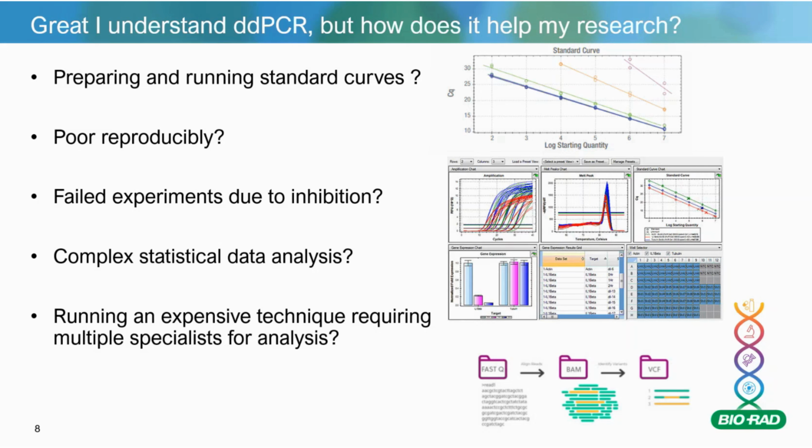And, you know, just to expand on this briefly, NGS is a really great tool for genomics, of course. I absolutely think it's a fundamental requirement for genomics. However, NGS is only going to give you a lot of information on something, but once you have a large quantity of information about something, you actually need much more granular, smaller details about changes within that thing. And that's where Droplet Digital PCR comes in.